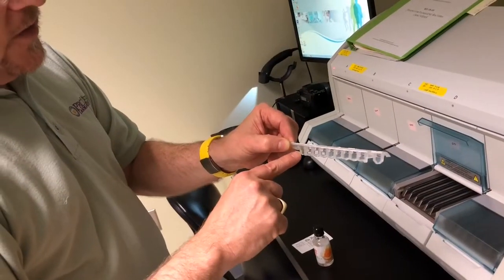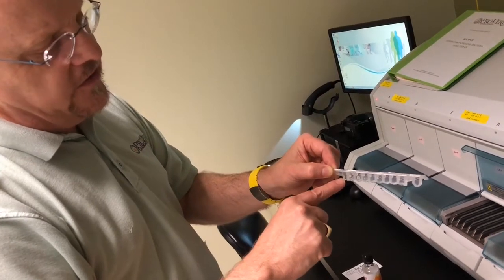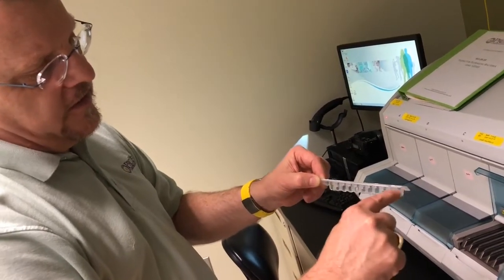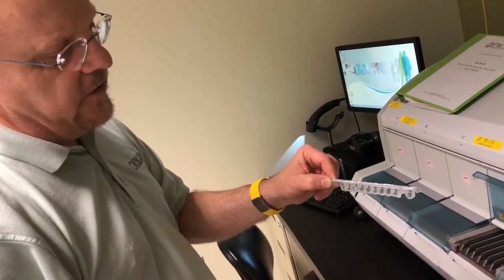Running the test, you have basically a little nozzle that comes and sucks up the sample, and it moves it down the chain and mixes it until it gets to the final sample, and then it's read using a laser.